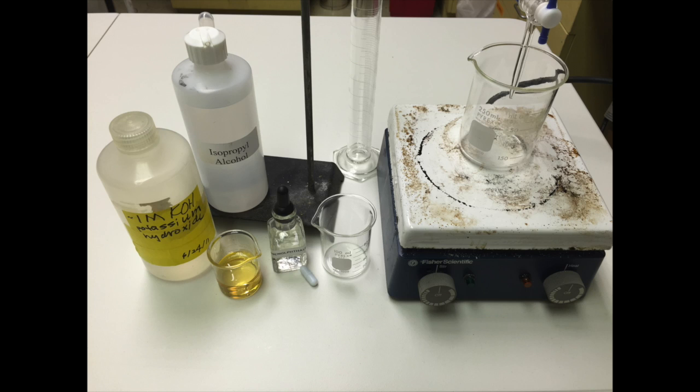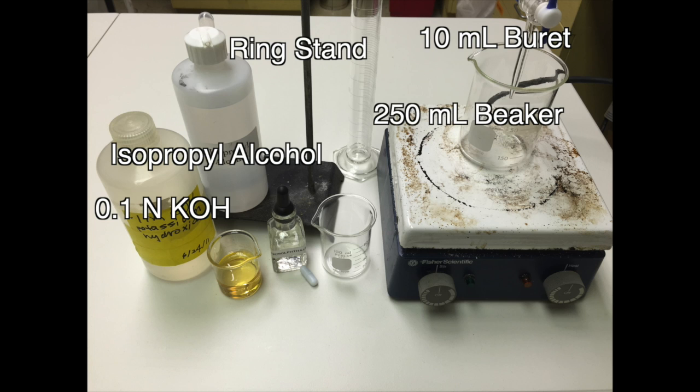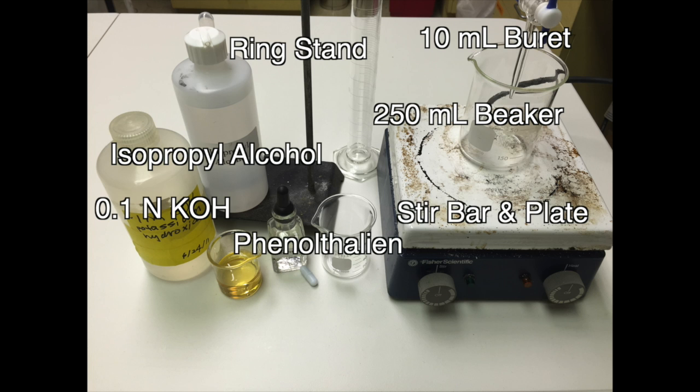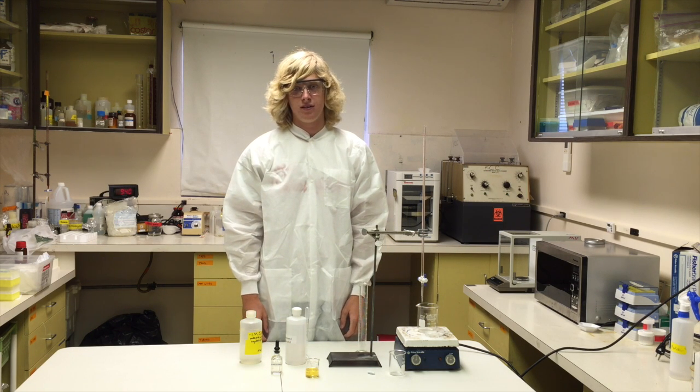For our project, we decided to make biodiesel. For this experiment, you'll need 0.1 normal potassium hydroxide, isopropyl alcohol, a ring stand, 10 milliliter burette, 250 milliliter beaker, stir bar and plate, phenolphthalein, and your biodiesel. Today we will be doing the free fatty acid test on the biodiesel to determine the amount of acid remaining.